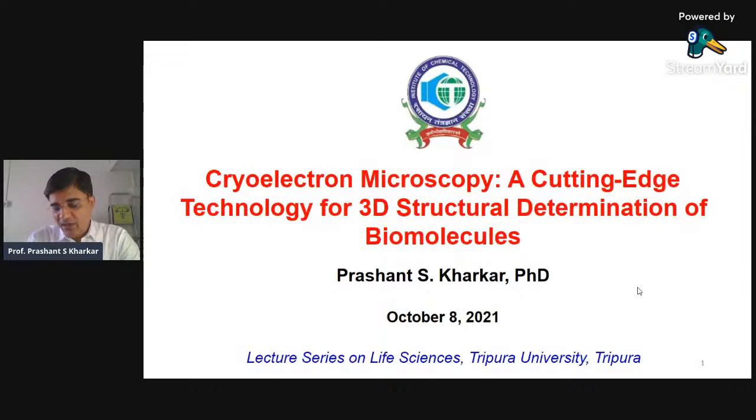So, students and faculty who are present here, like I mentioned, I'll be talking about cryoelectron microscopy, a cutting-edge technology for 3D structural determination of biomolecules, particularly proteins. Although the technique is evolving, the hardware as well as the electron microscopy part of it has undergone radical changes since last decade or so. The technique is not old, not new, I would say.